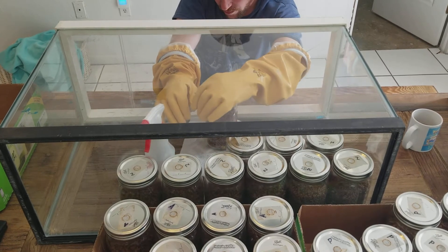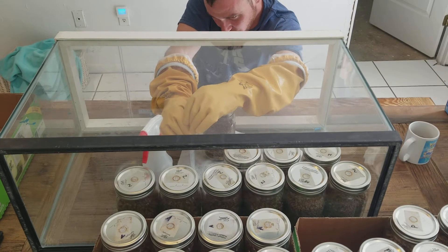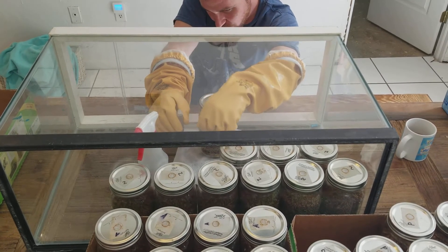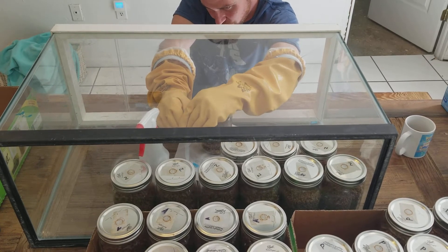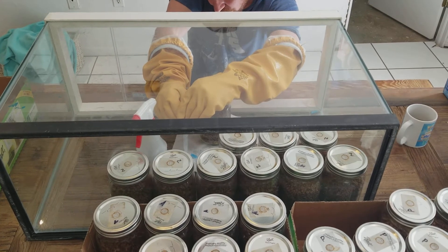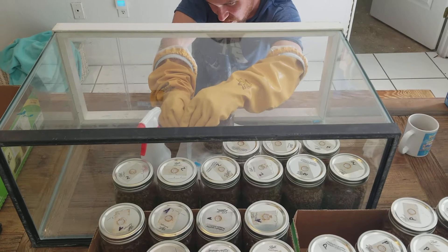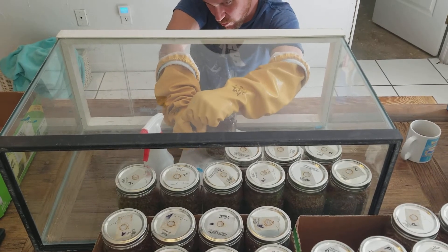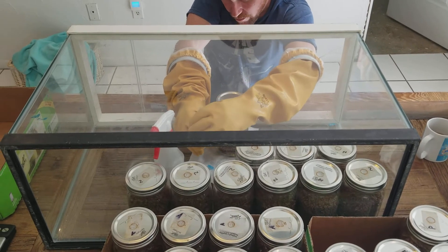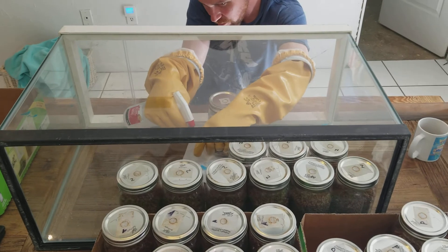I'm going to open my liquid syringe here. I'm going to push the air out — let's get it set up. It's a little sticky, trying to get it to move. There we go, get all the air out. Then I'm going to spray a little alcohol on the end of it.